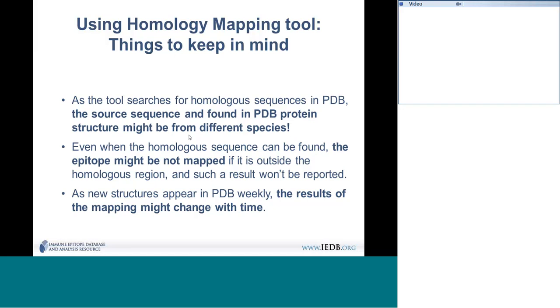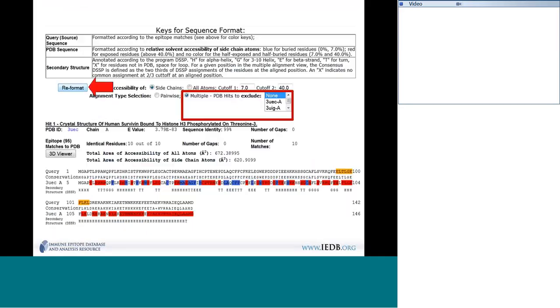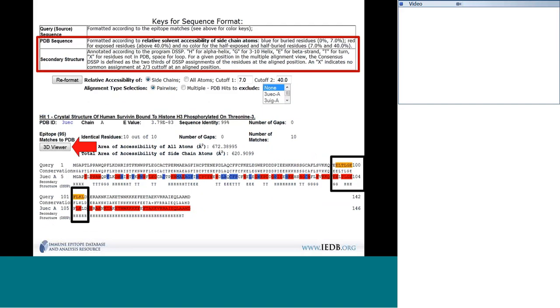That's what I already showed in that example. For example, say that's my epitope, and it's mapped on the sequence from PDB. If the sequence from PDB would end here, and only be that short, then the epitope is not there. If an epitope cannot be mapped, you won't get that result. The protein can be not fully sequenced, but the epitope should be in that region, should map to that region. And we just don't show such results.